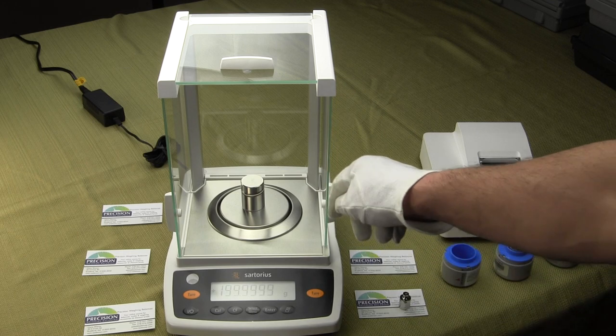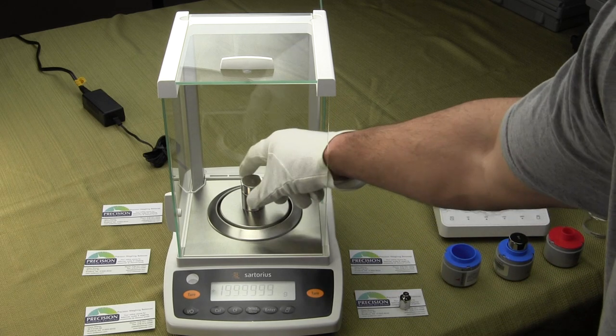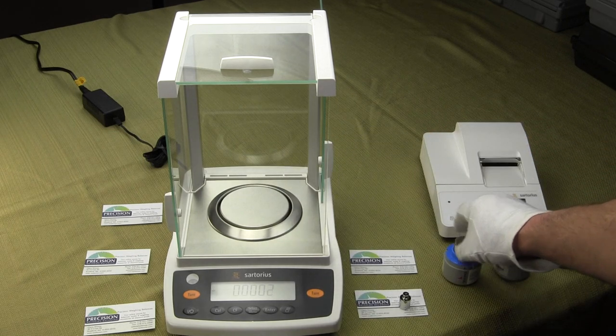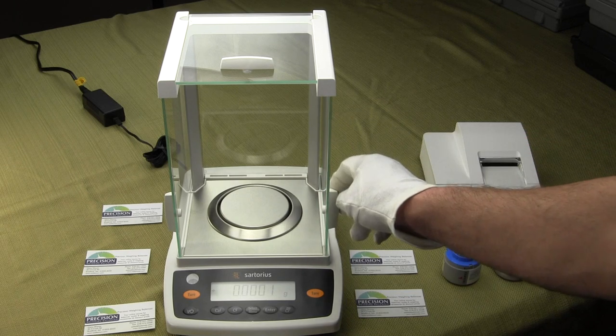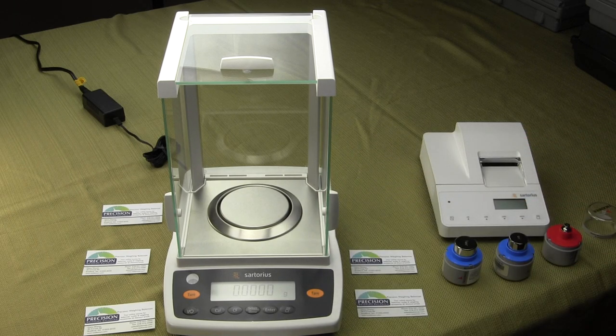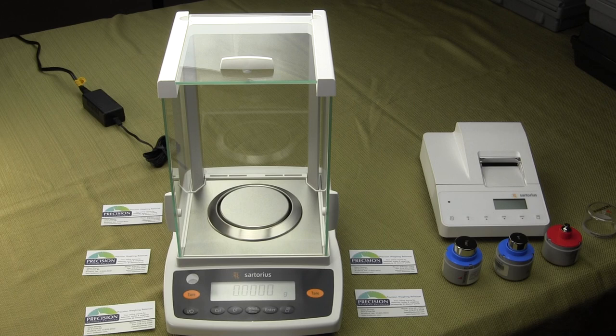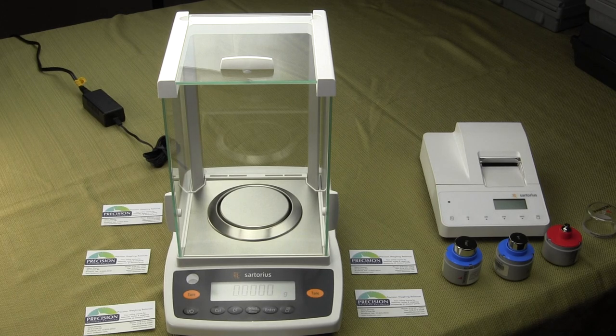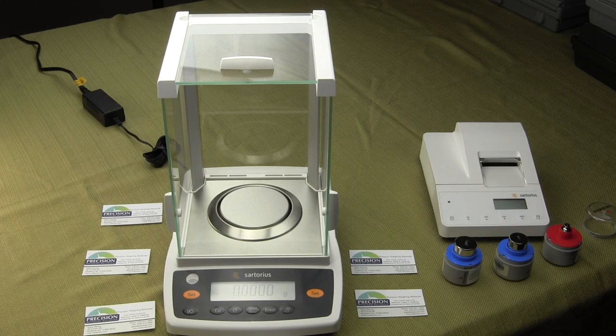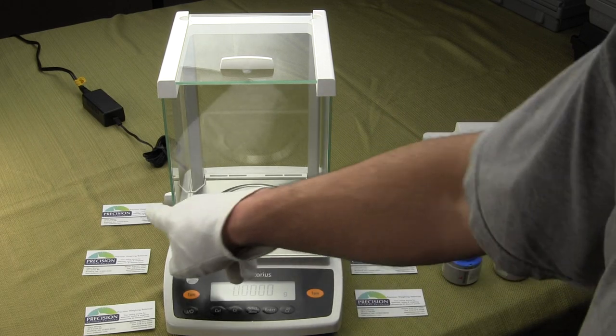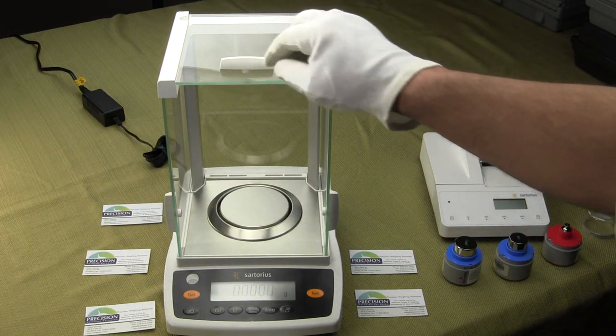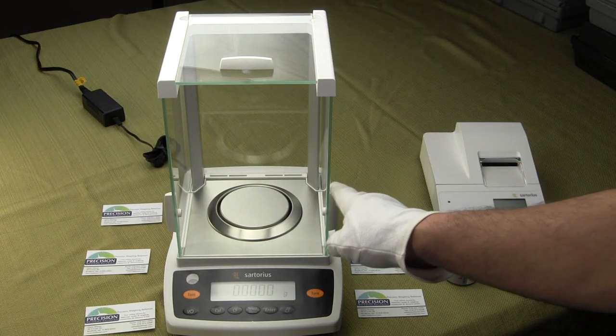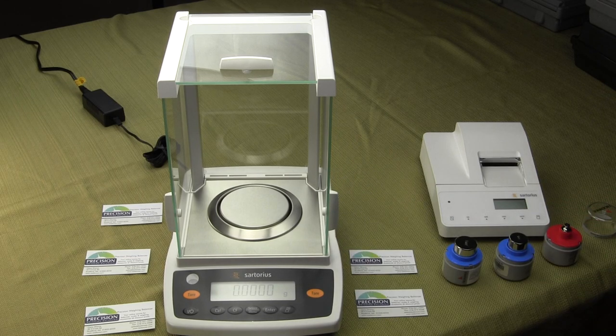This is the Entris series, Sartorius' basic series. You do have plenty of advanced weighing applications like parts counting, percent mode, even density determination. You have a three-door glass draft shield with this balance. The balance can be opened from either the right, left, or the top. The glass draft shield is not removable, it's permanently affixed.